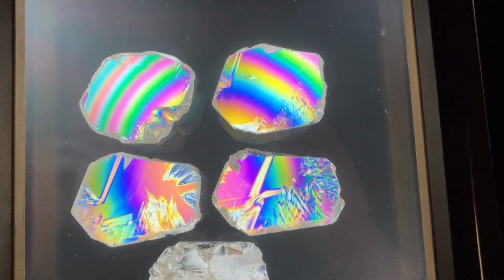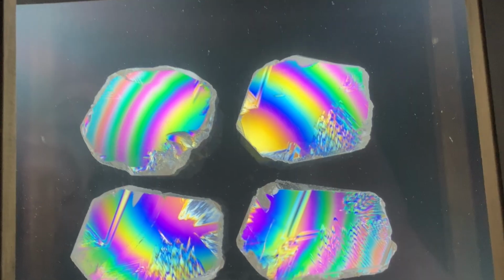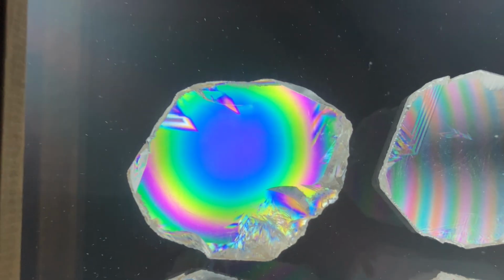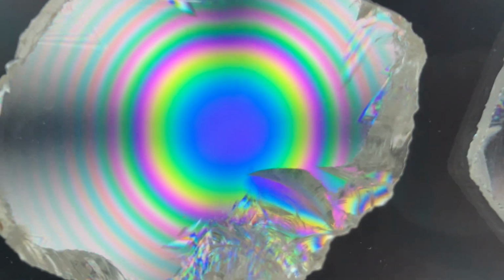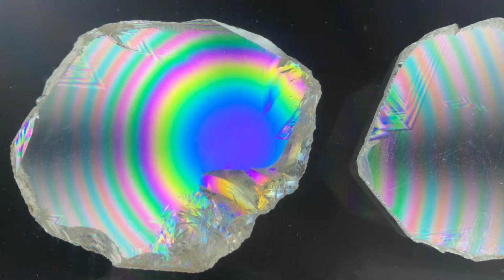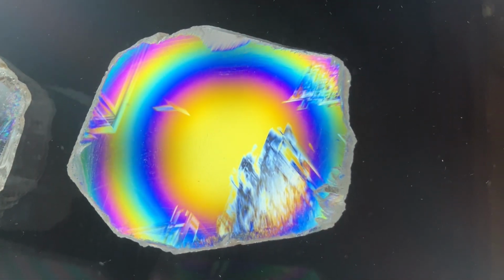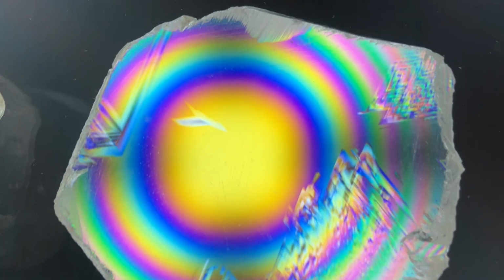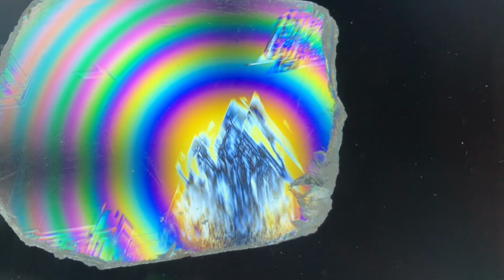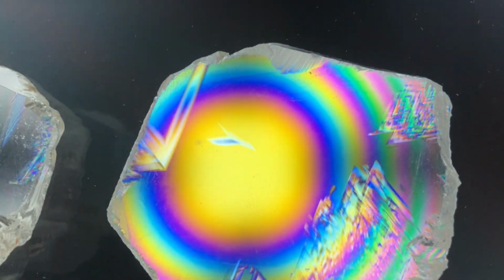We'll zoom in and we'll start with the most basal section of our quartz crystal, taking a bit closer look here. This slice has just a little bit of Brazil law twinning, and as we get closer you can see a really nice quartz uniaxial optic axis interference figure. Moving on to our next slice, you'll notice that the Brazil law twinning actually gets a bit more developed here, but our optic axis interference figure is still doing pretty well in the areas of the crystal that aren't twinned.